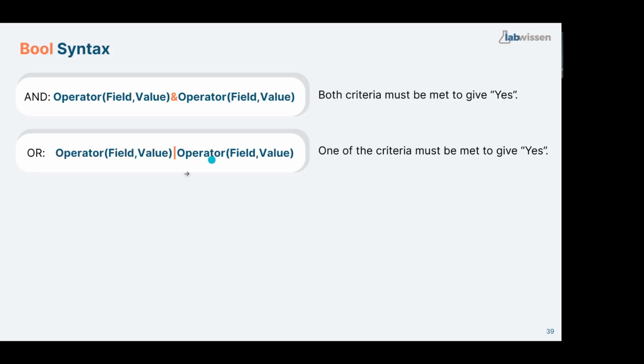Here, it's also very critical. We don't use this slash, the one that is the line name. We use this one. I forgot what it's called, but you can find it. If you look thoroughly at your keyboard, you can find this symbol, depending on which country your keyboard is from.